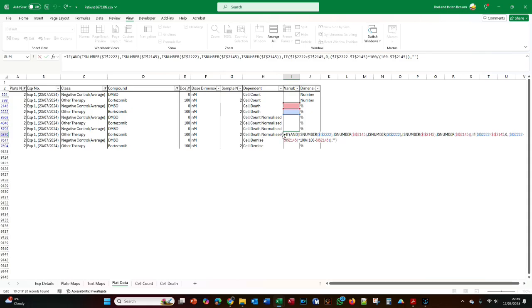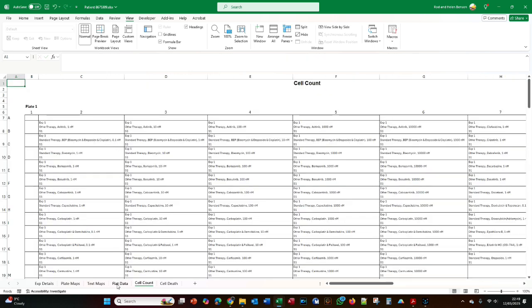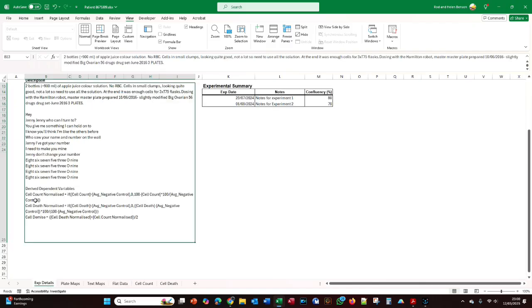So that is showing you how the Platemaker Wizard has not only built the container workbooks, where as data is entered, it's going to enter into the flat data table, but then it can take those values and further down in the table it can start to create formulas that you define using the Platemaker wizard. And we will learn in a later tutorial how we define these formulas on page 4 of the wizard. The formulas themselves look exactly like this. So on page 4 you will have a field where you enter the formula and it looks exactly like this.